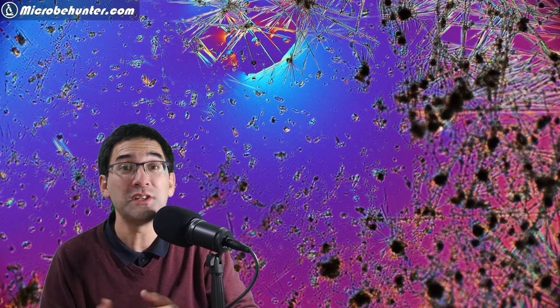Not all crystals are optically active. Salt, for example, regular table salt also makes very nice crystals but the colors are not there. The reason is because the salt crystals do not change the polarization of light. It depends quite a lot on whether the molecule is symmetrical or not.